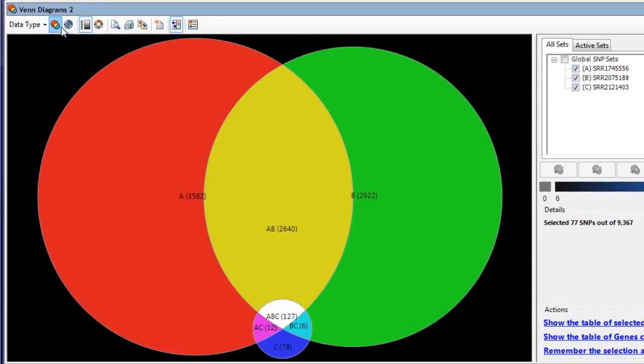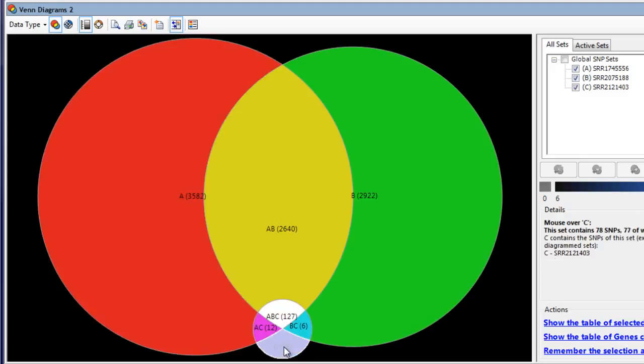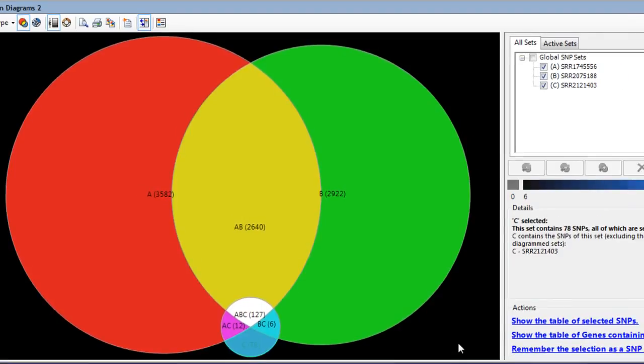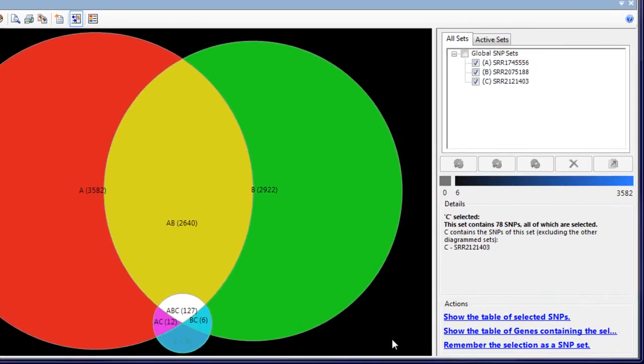So, for example, here we can see that two of the strains contain many differences from the reference genome, while a third strain has relatively few variants. We can use this information to look at interesting subsets, for example, the SNPs that are missing from the two more divergent strains.